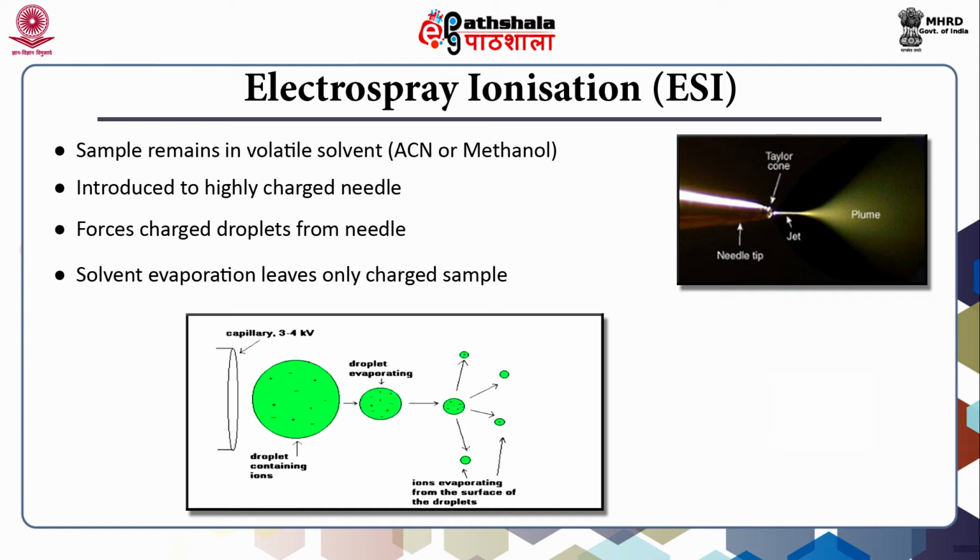The purpose of saying this is that the sample, in the form of peptides which have been generated and purified, is mixed with volatile substances which are allowed to enter the source. When they enter the source, they are forced to form charged droplets which come out of the tip of the needle, and subsequently they evaporate, leaving the charged samples.